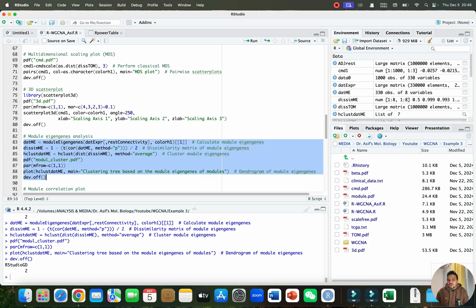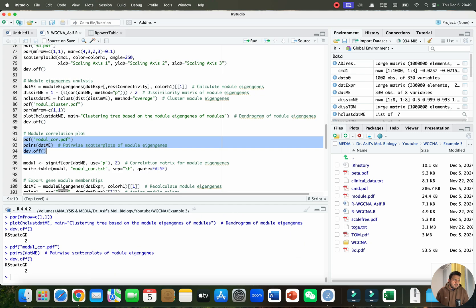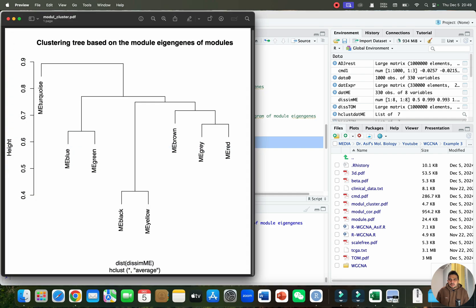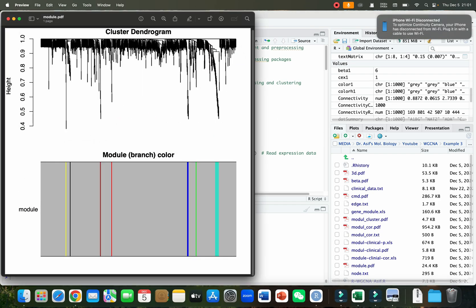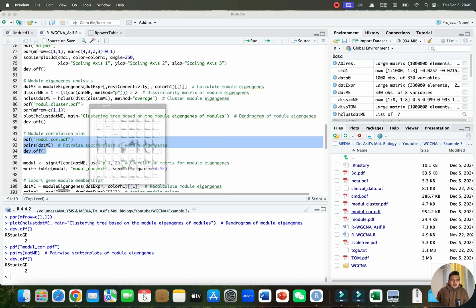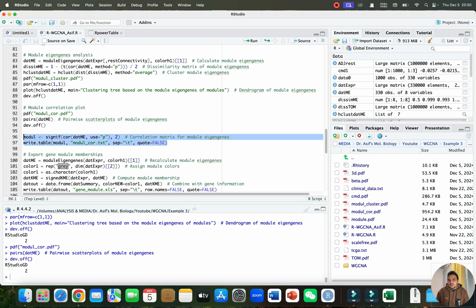We can now create a module correlation plot — a pairwise scatter plot of module eigengenes. Module eigengenes are the representatives from each module, usually based on the first principal component. After running, we have a module cluster dendrogram based on height and a clustering tree based on module eigengenes. This is followed by running the correlation matrix and writing the table.